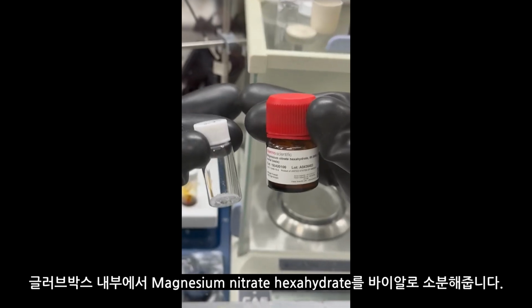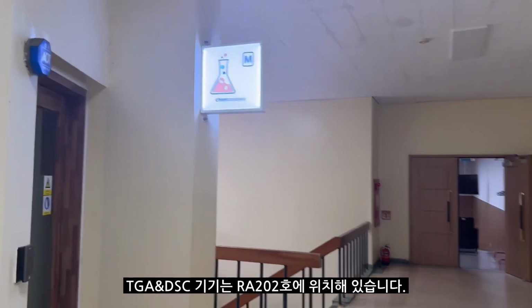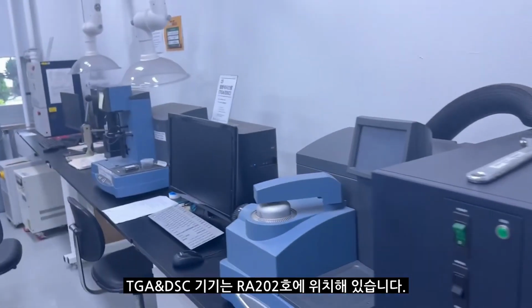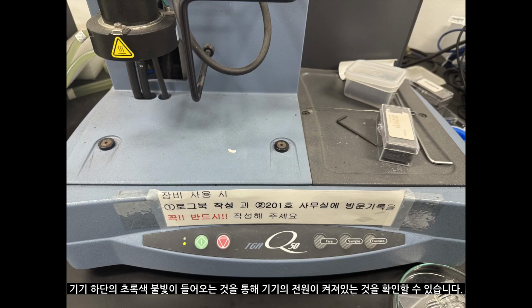Subdivide magnesium nitrate hexahydrate into vial inside the glove box. TGA and DSC devices are located at RA 202. Open the nitrogen gas valve. Switch on the TGA device. You can tell that the device is powered on by the green light at the bottom.